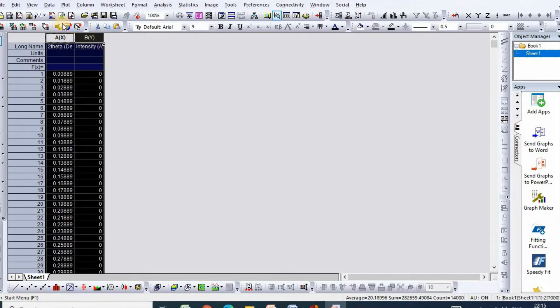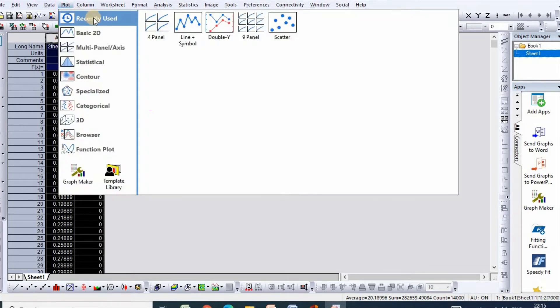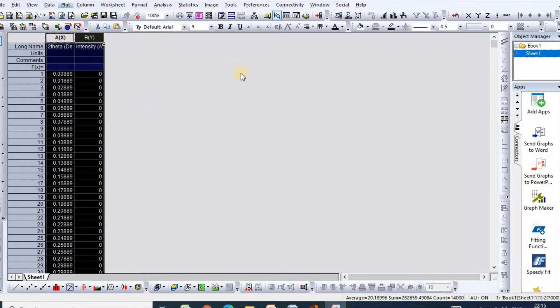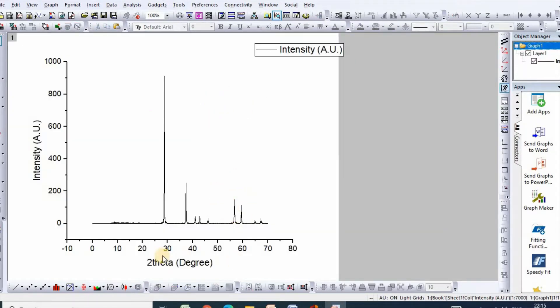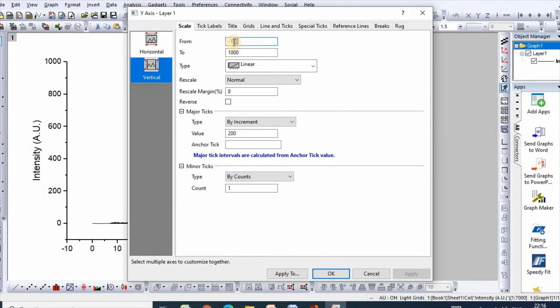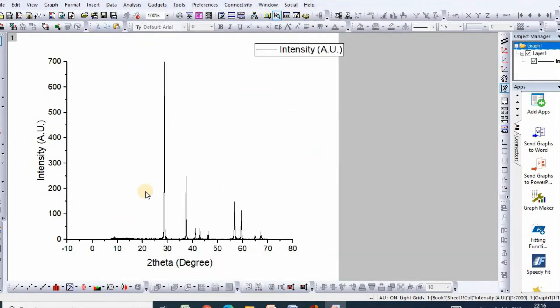Now, let us click plot. Here is the plot. You can adjust X and Y values. For example, you can change it to 700 by 100. Similarly, you can also change X axis to make it publication quality.